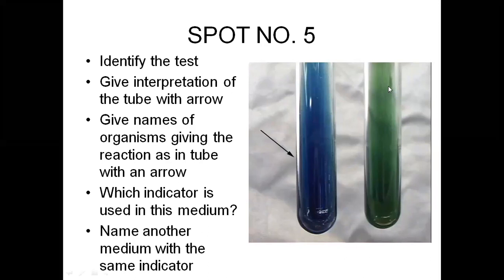If we put a colony or the sample on this agar, this is the original color. If the citrate is not consumed, it is going to stay green. The test is negative. If it turns blue, the test is positive. The indicator is bromothymol blue and citrate is used.